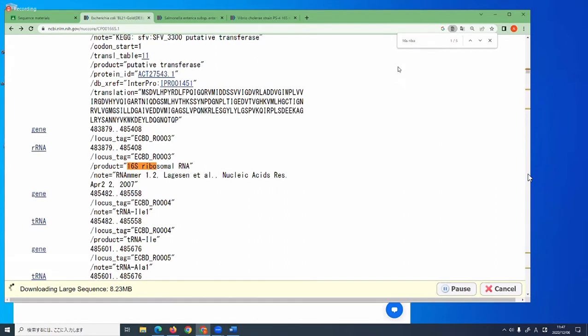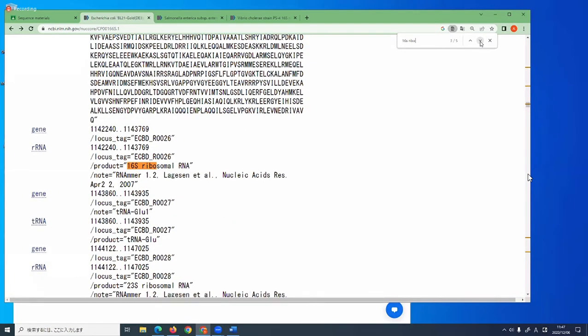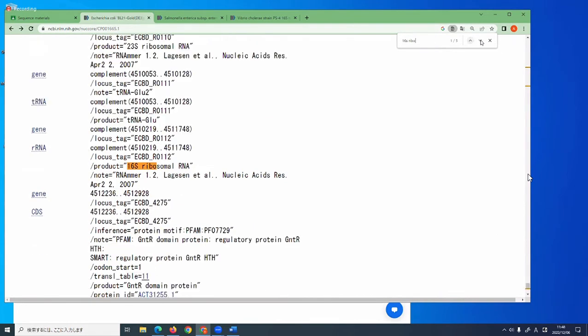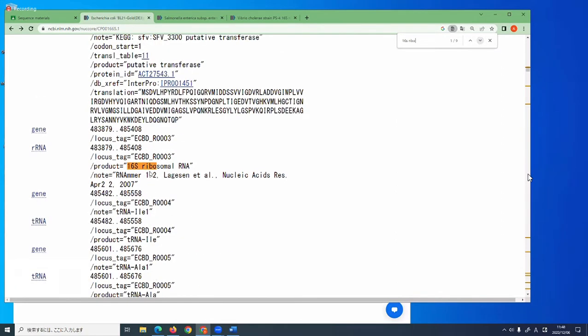All right. So we just search 16S ribo and it hits here. And altogether, there's 5 hits in the page. I think there should be, no, the rest are not. This is the third one, there's 2. Usually in the bacteria, there'll be about 2, 3, 4 copies of 16S ribosomal RNA. So let's just take the first one. Let's assume that they are all identical. Or there's 9. There's more than that. Let's take the first one. All right, the first one.